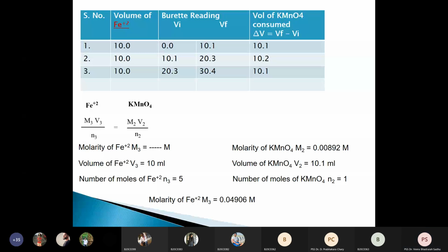How? In the same way as you did in the previous titration, the estimation of OH minus ions and estimation of carbonate ions. You take the concentration of the particular ions and multiply with the molecular weight of the ions.